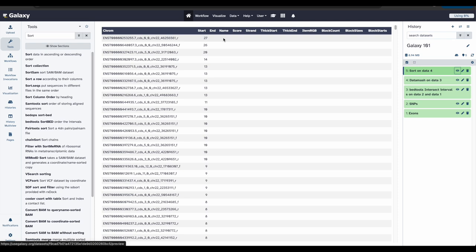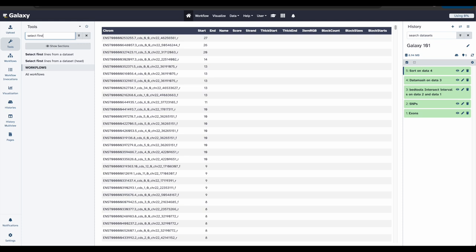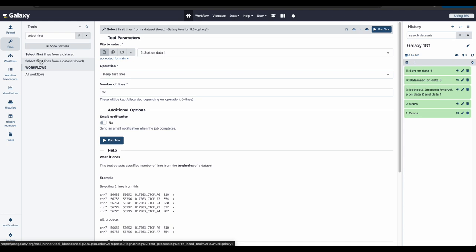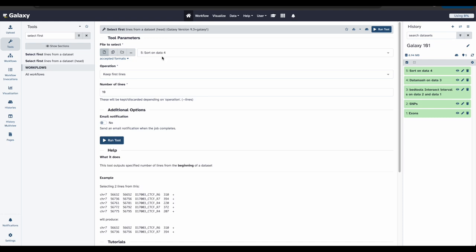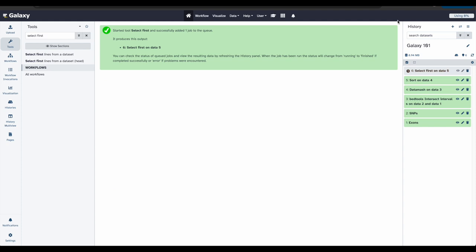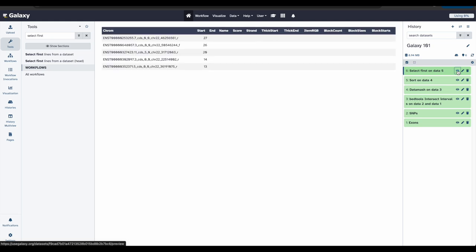But let's say we want a list that only shows the top five exons with the highest number of snips. To do this, we'll go back to our tools. And we will search select first. And we are going to select first lines from a data set, parentheses, head. We will choose the results from our latest tool that we just ran. We will keep the first lines. And instead of ten lines, we only want to keep five. Now you can click run tool. Let's take a look at the results.